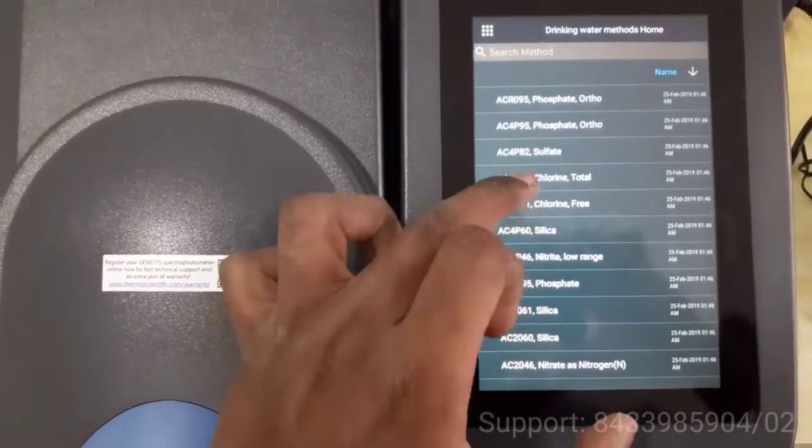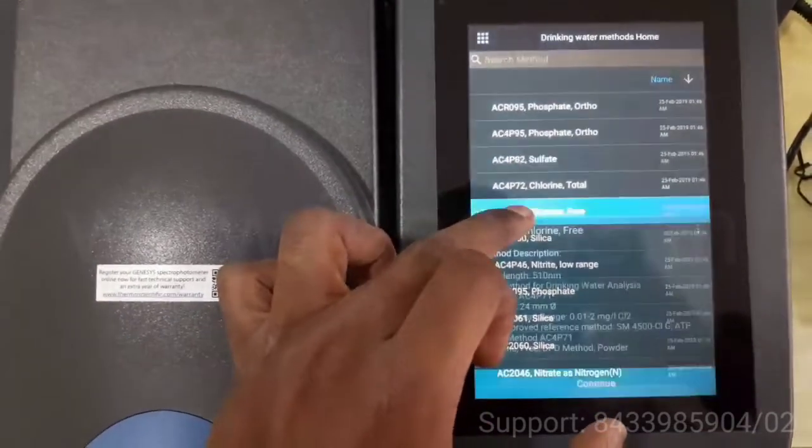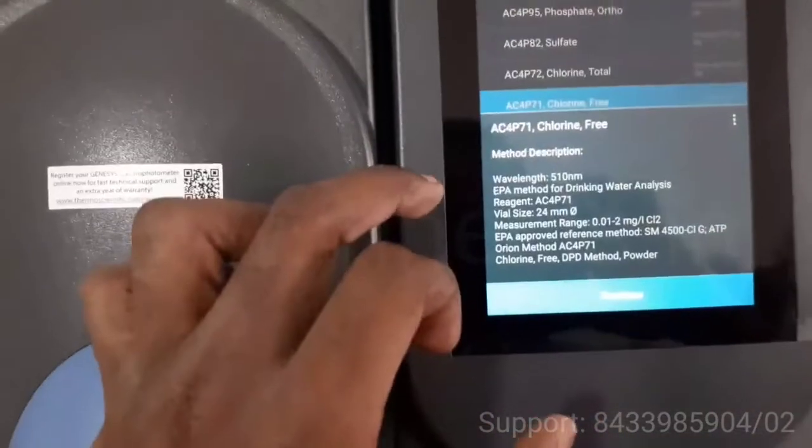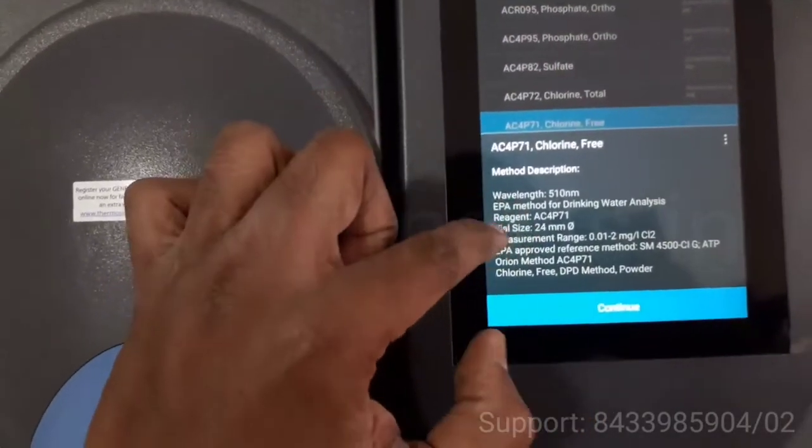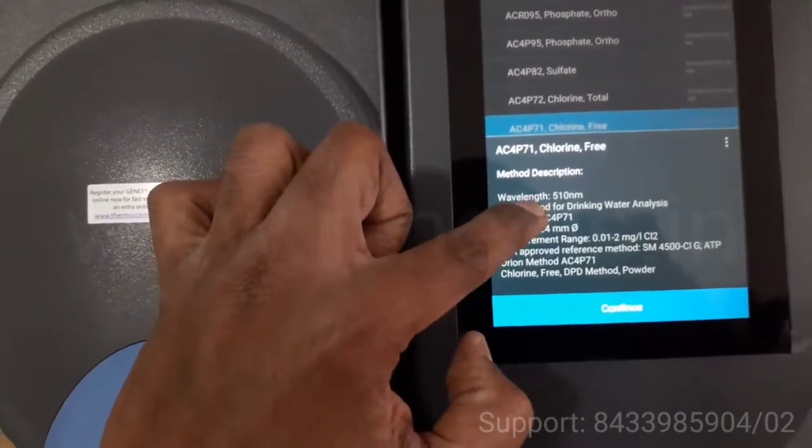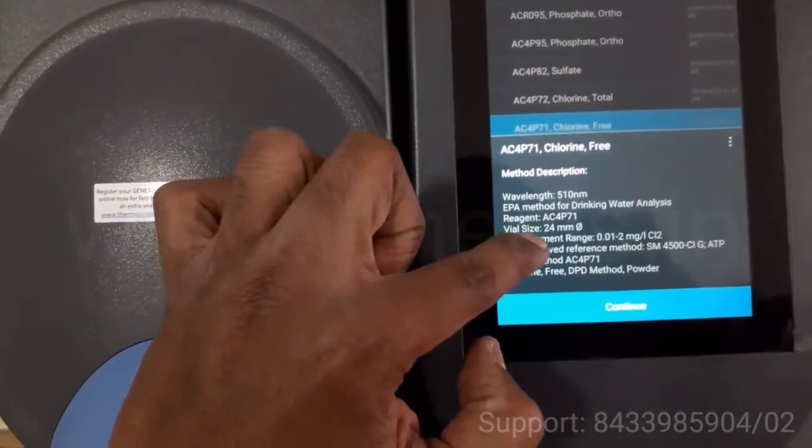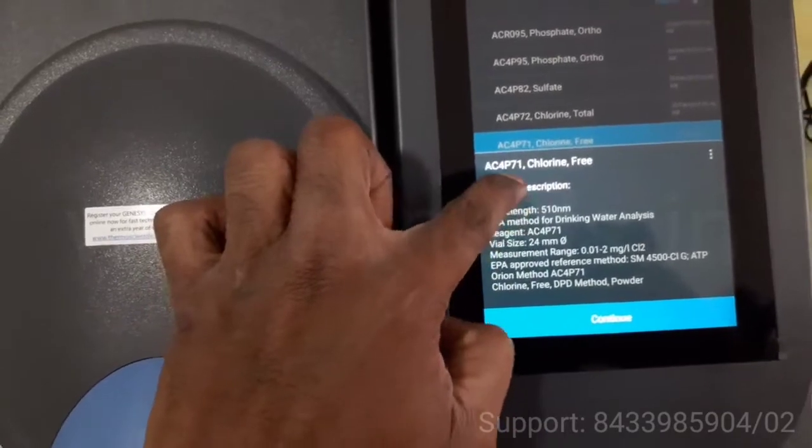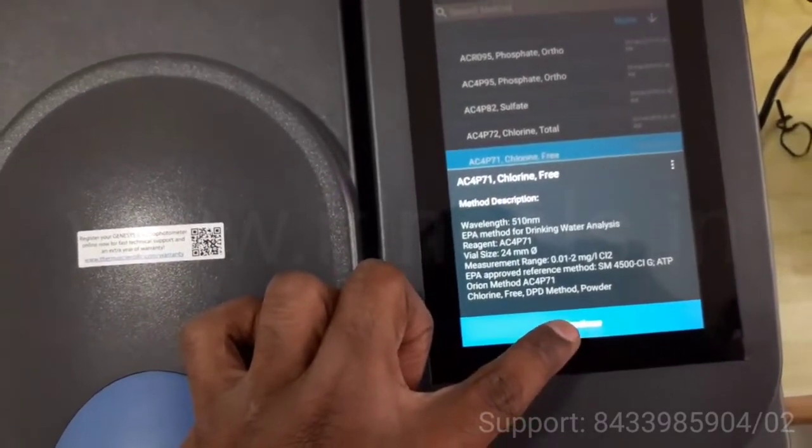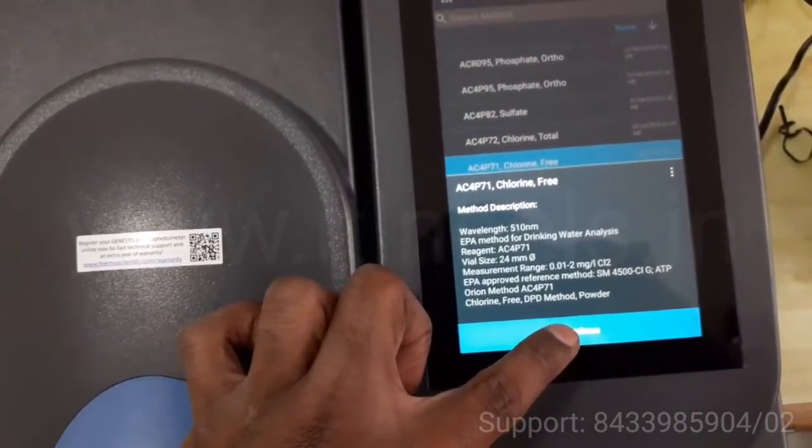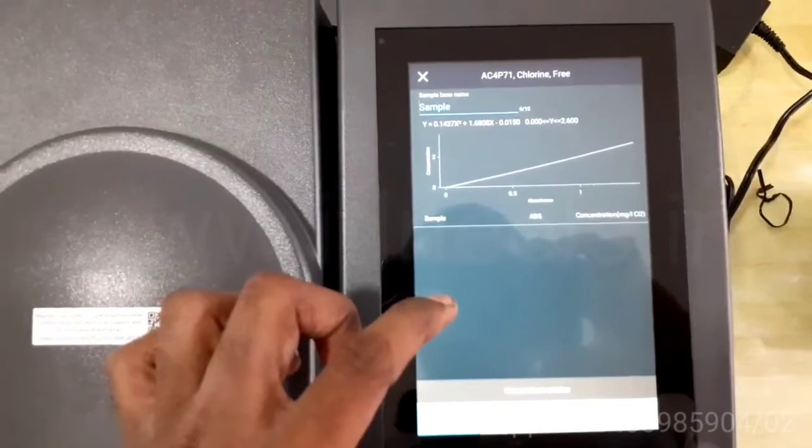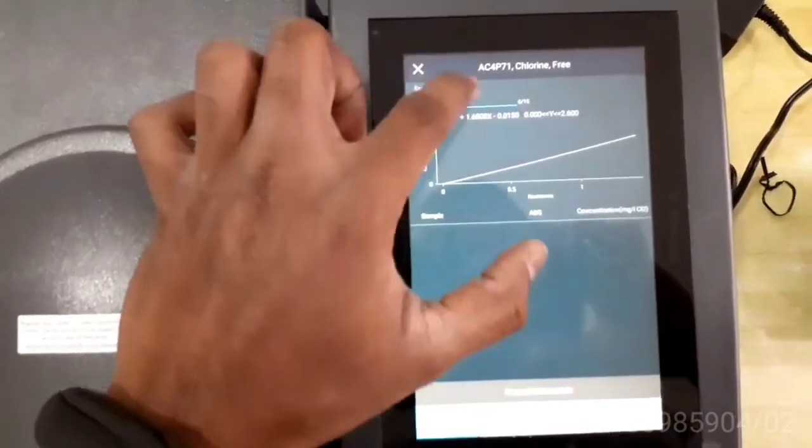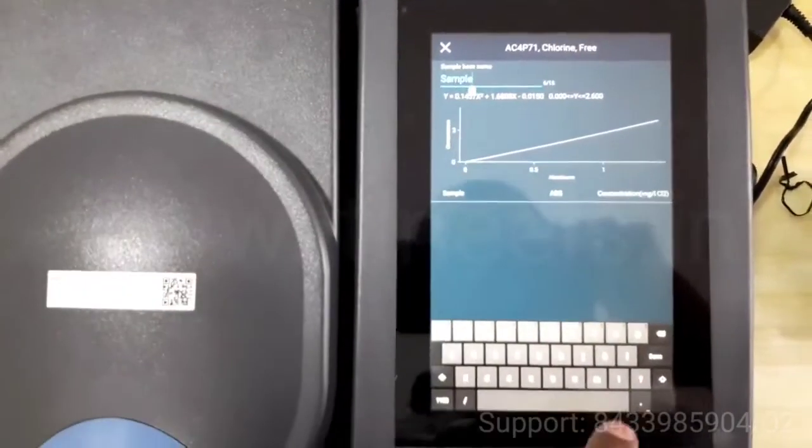There is a specific method also. You can select it, and it will tell you what all is required, at which wavelength, which reagent. You can change the size, everything, and press continue. You can change the name also over here.